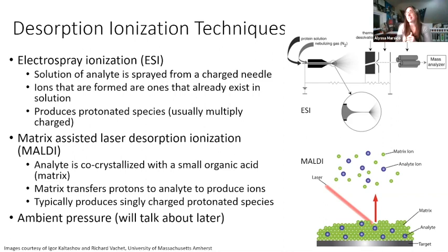And electrospray ionization is so soft. This is commonly not done, but they did it to prove a point. They analyzed an active virus using electrospray ionization mass spec. So they ran it through, they went ahead and generated a charge, they detected the ions, they got a mass spectrum, and they kind of rigged the instrument to collect the virus at the end of the analysis.